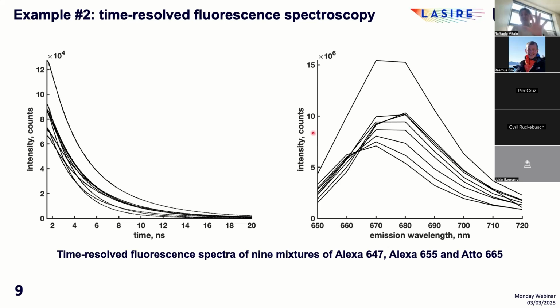Here you have a very schematic representation of this data set in which I displayed for every mixture sample an individual fluorescence decay integrated across all the spectral channels and an individual spectral profile integrated across all the decay time points.